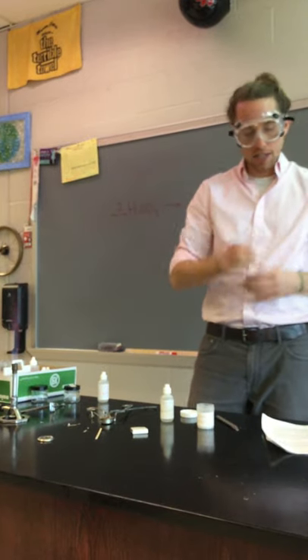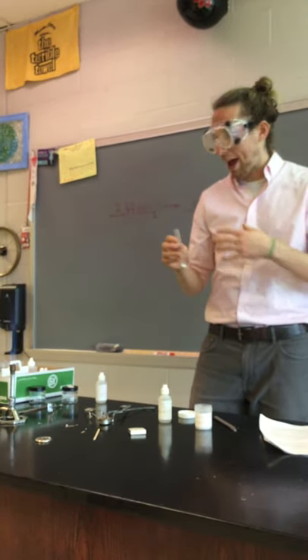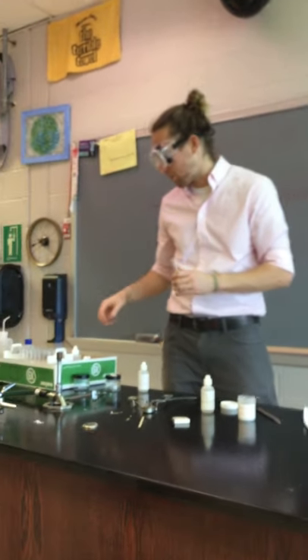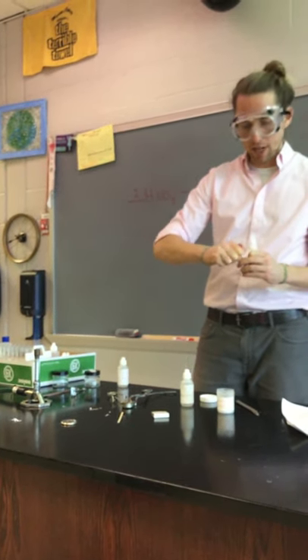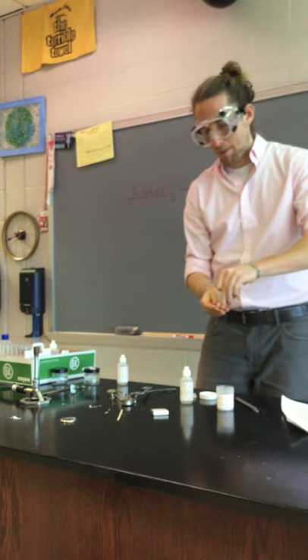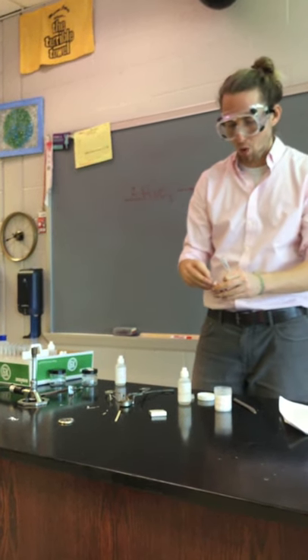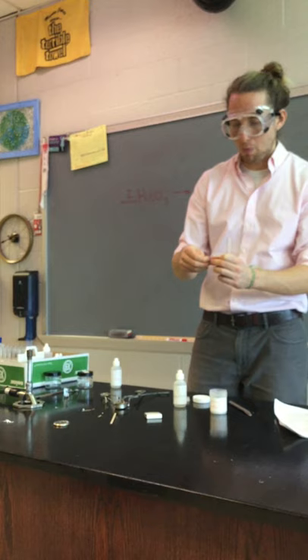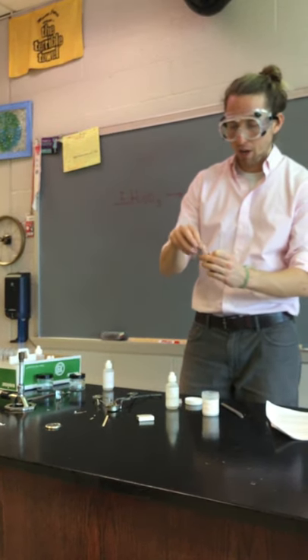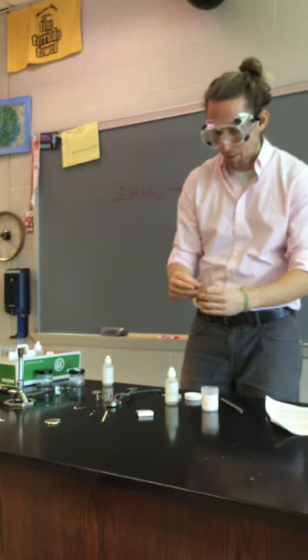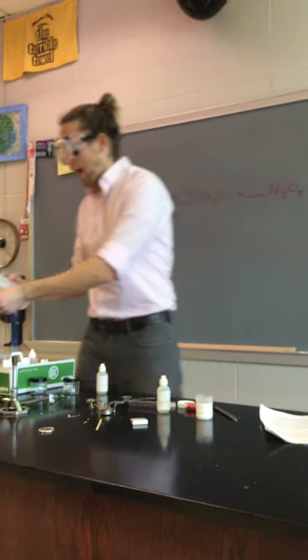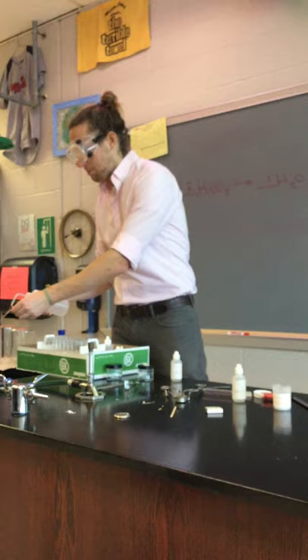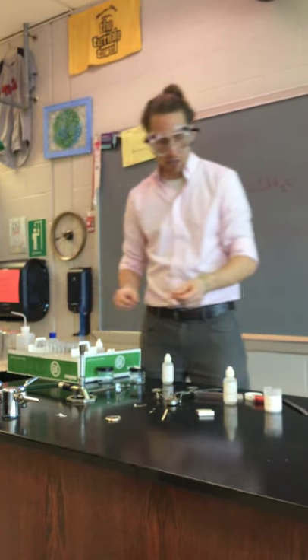So now we have our ammonium carbonate. We are going to hold this into the Bunsen burner. And once we have this thing heated up, we're going to take a piece of litmus paper and put the litmus paper in the mouth of this test tube to see what happens. Now I'm going to get my litmus paper set up because it actually works better when this is a little bit moist. So I'm going to take my litmus paper, put some deionized water on top of it, and moisten it up.